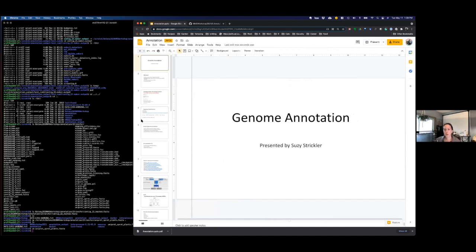All right, so in theory, you have a genome assembled now. Jacob just told you a bit about how to go about doing that, so hopefully that's a little bit clearer than it was a couple of hours ago. And now what we're going to do is take one of the files that came out of that assembly work, and attempt to predict genes on it.